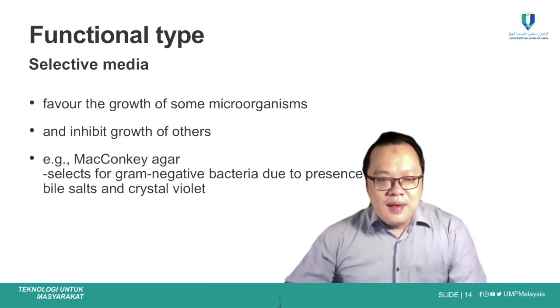And MacConkey agar is commonly used in the diagnostic microbiology lab in the hospital because gram-negative bacteria usually cause pathogenic disease in humans.